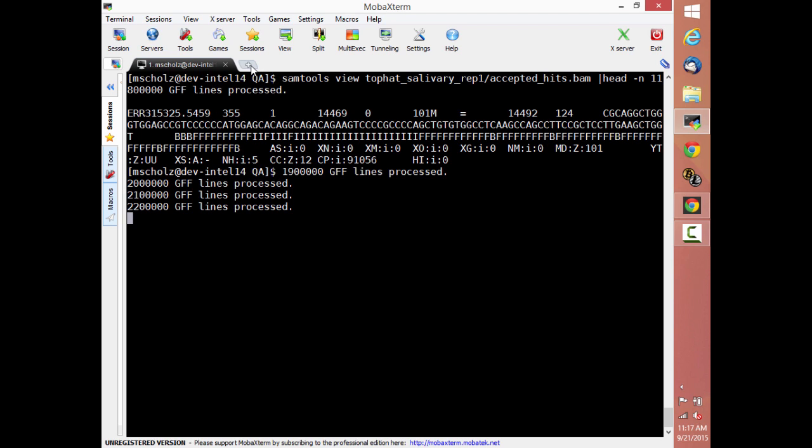Position. So position in the reference genome, or position at the end of the alignment in the reference genome. And then the sequence, the quality, and a bunch of stuff. So it's taking all of this information every time you do an alignment, and it's outputting it to a file. And then it's taking that information and trying to get the actual genes that that's aligned to.